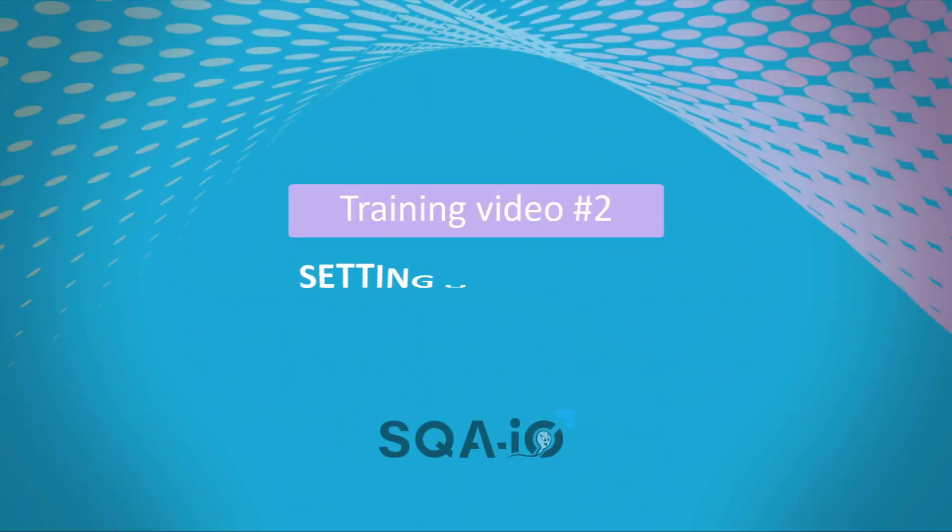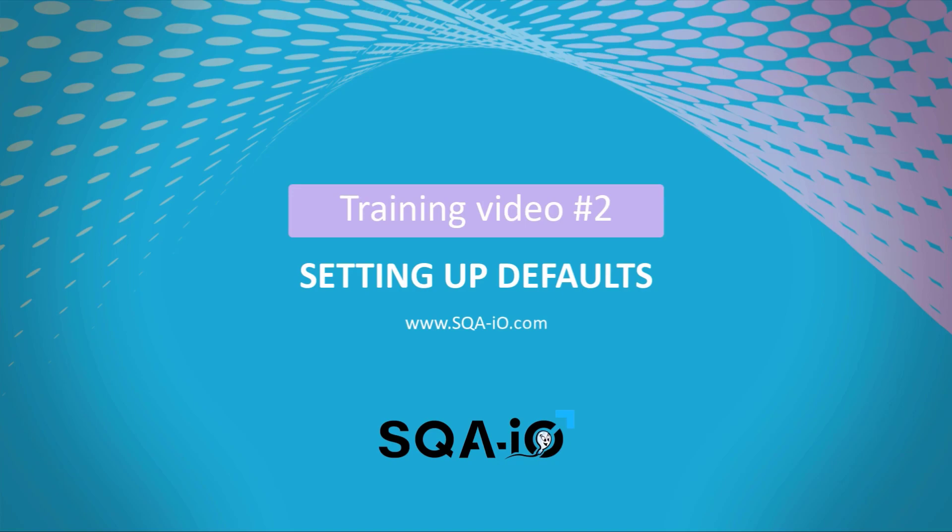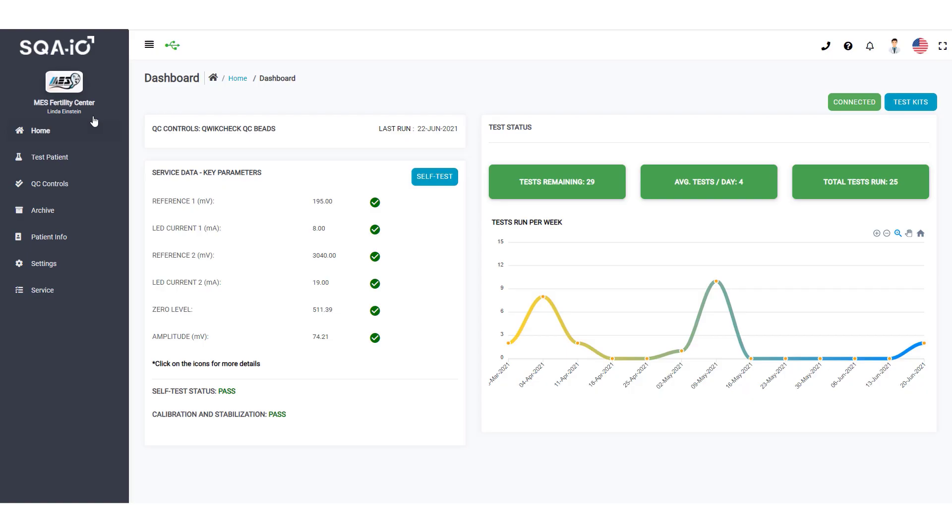Welcome to our SQA-IO training video on setting up the system defaults. Begin by selecting settings from the navigation menu.